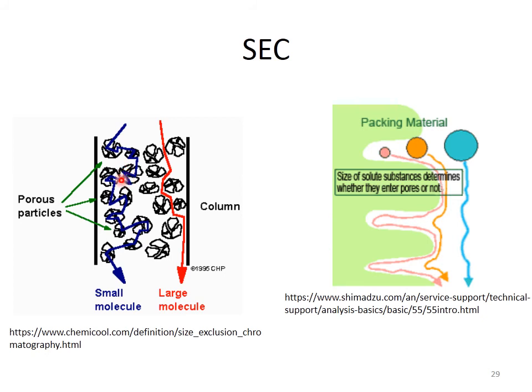Then the protein moves further, and then it will be trapped in the channels of the next bead. And eventually it will go into the pores of the next bead and the next one, and in this manner the small proteins will travel through the channels which are present in these beads, and then eventually they will be released from the column.